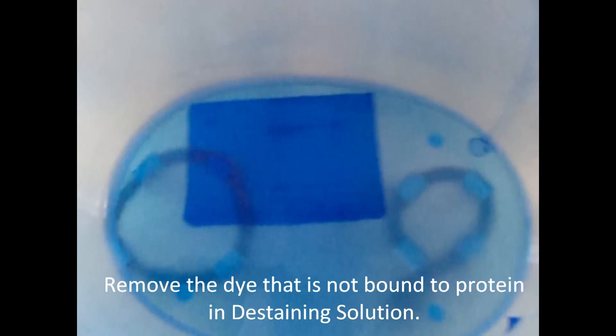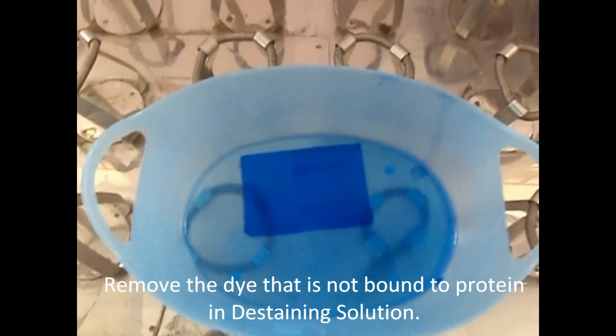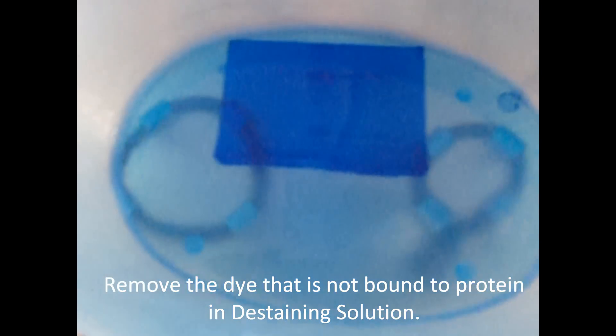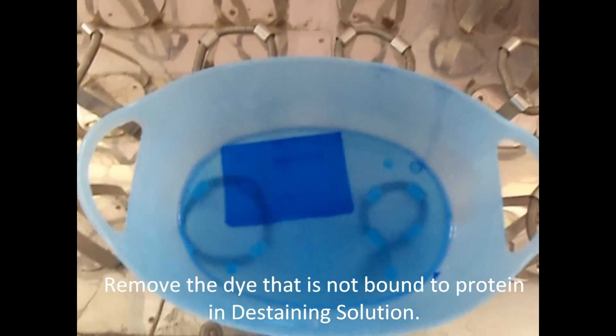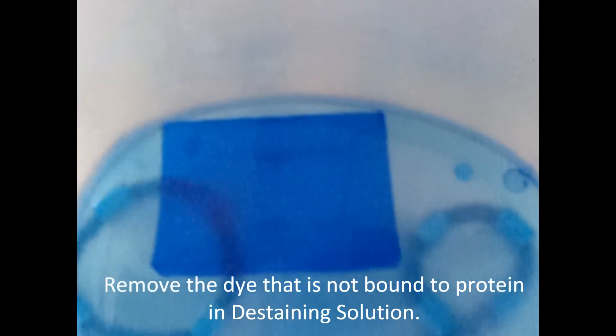Remove the dye not bound to protein using de-staining solution. After 24 hours, with gentle agitation and several changes of de-staining solution, the gel background becomes colorless and leaves protein bands colored blue.